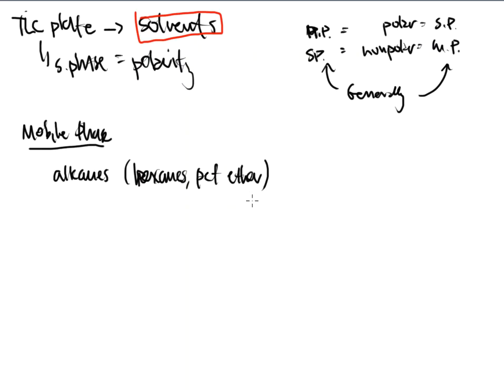Very common in a laboratory. Well, we can increase the polarity a little bit, and we can throw in ring structures maybe that have some delocalization. So those would be things like toluene, right? Toluene would be a very good choice. It's still non-polar. It's still mainly carbon and hydrogen, but delocalization is there. Some electrons can move around. There's some double bonds involved.